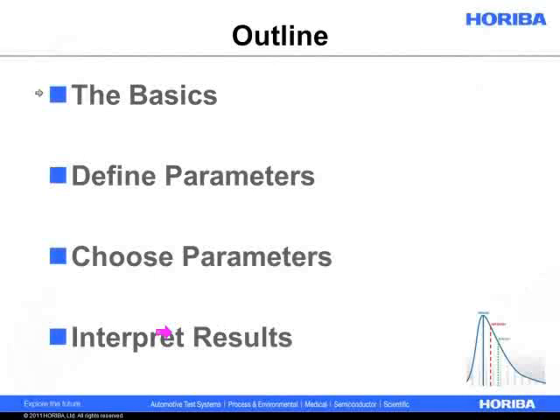So the outline for today's presentation is we're going to cover what I call the basics up front, and that's just to get everyone on the same page. And this presentation is really best for people that maybe have lost a little bit of confidence in how they can understand what they're seeing in their results, or people who are brand new to laser diffraction.